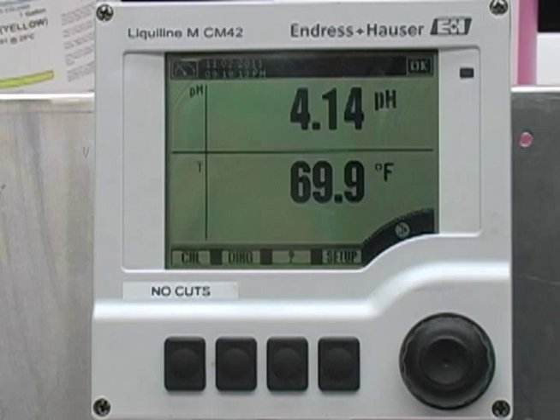To illustrate the pH meter calibration, we will be using a Liquiline M CM42 made by Endress and Hauser. To get a better understanding, let's go over the basics of pH and calibration first.